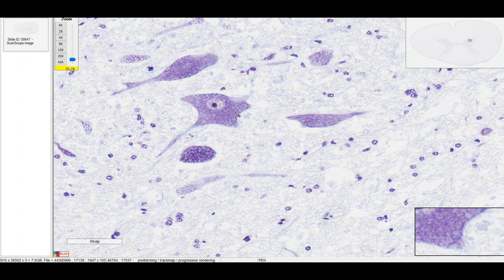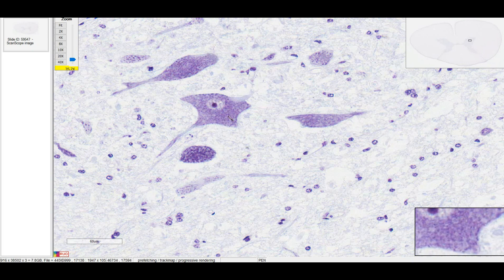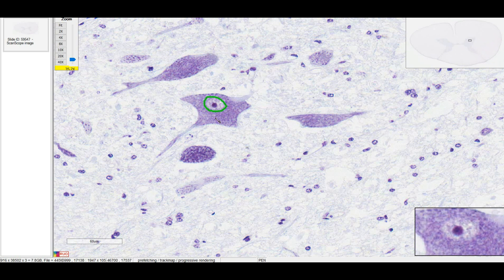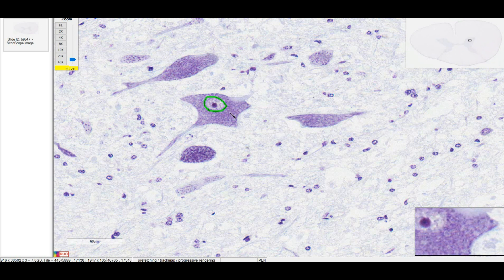Let's take a closer look. All this purple stuff that's being picked up is called the Nissel substance. You can see that it's filling the neuronal cell body, also known as the perikaryon. Here's the nucleus right here. The dark purple is found in the middle, is the nucleolus. And in the cytoplasm, you can see a lot of Nissel substance as well because the rough ER also has RNA.